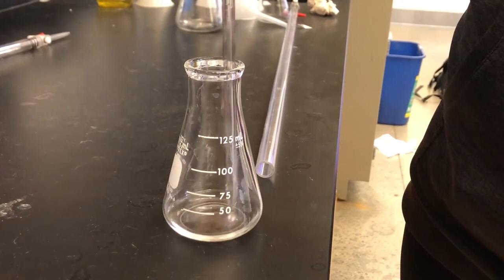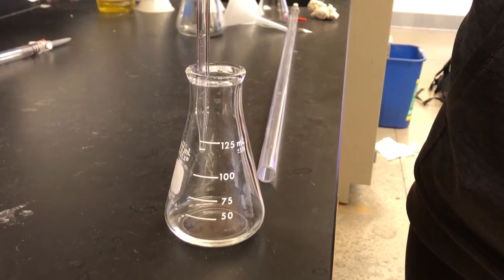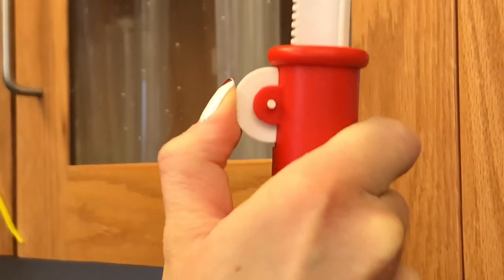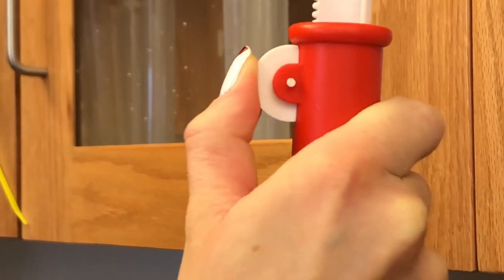As you squirt the acid into the flask, make sure there is no liquid left at the bottom of the pipette. Scroll up and down on the spin wheel to make sure that all the liquid comes out.